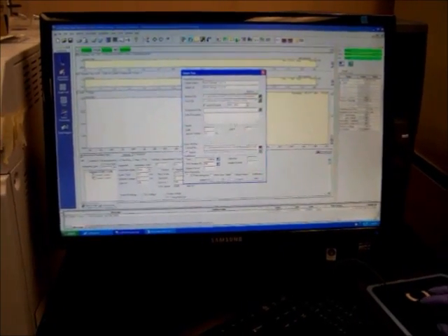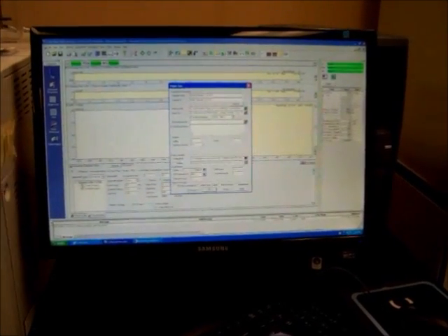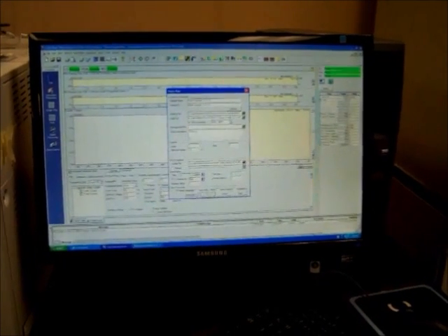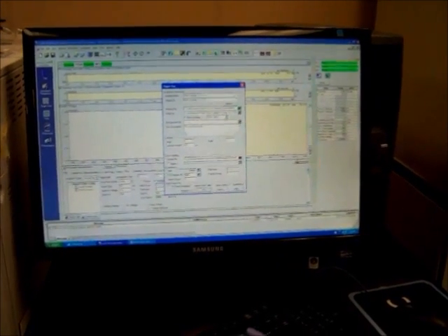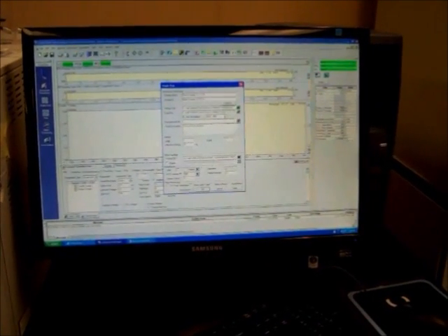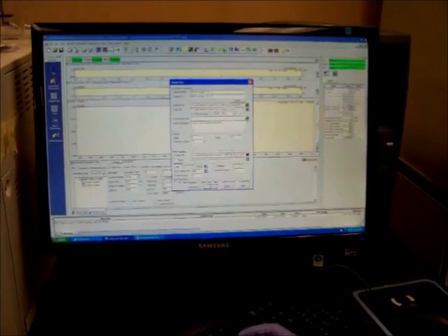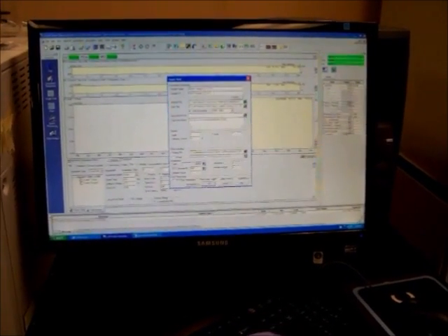Dating it. And then data description. Quick say, this is a test to demonstrate LC-MS.